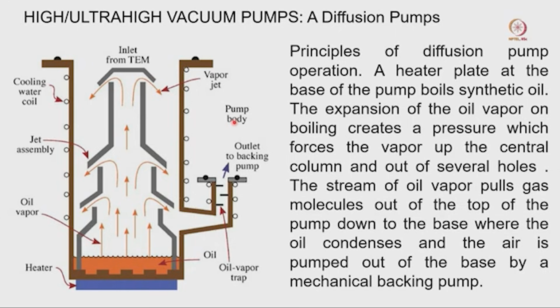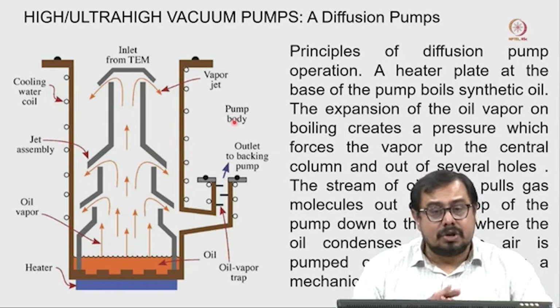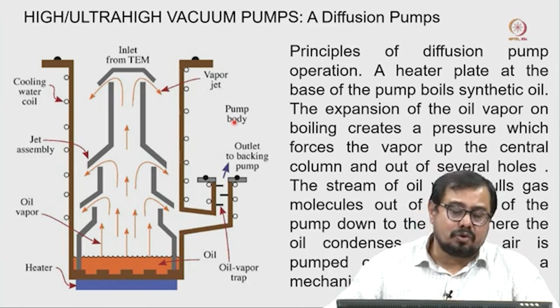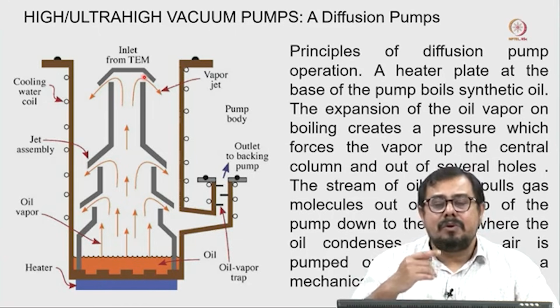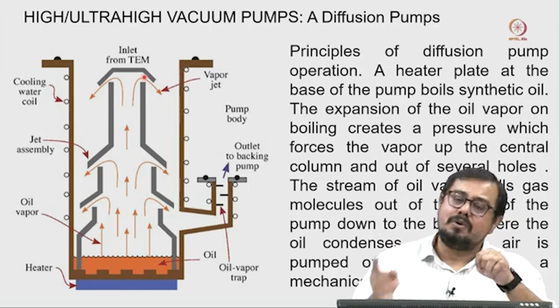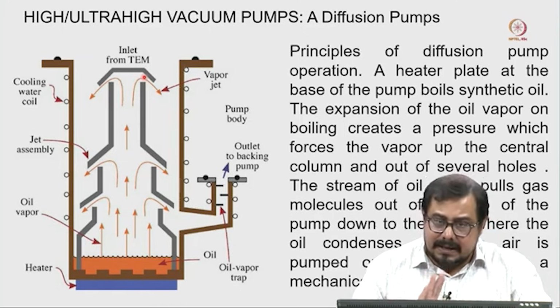Why are we interested in the oil diffusion pump? We are mainly interested in the oil diffusion pump because it generally gives us a very high vacuum and it is not generating any noise. Why are we worried about noise? Most of the time, this inlet from the microscope is directly connected with the microscope, and if the pump constantly generates noise, this mechanical noise and vibration will transfer to our images, it will go to the detector, and our data quality will be really bad.